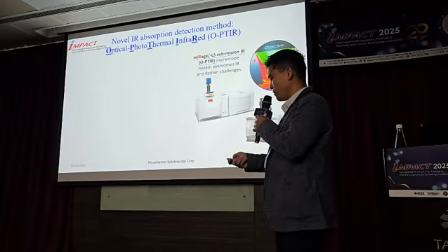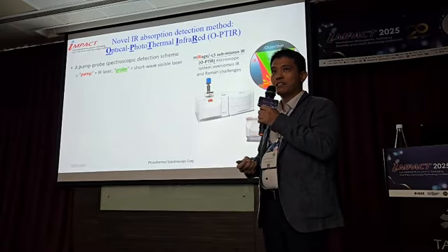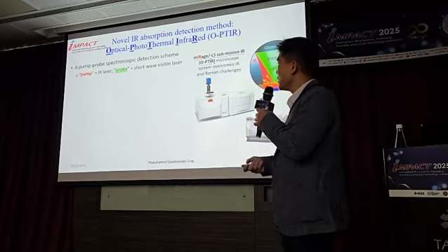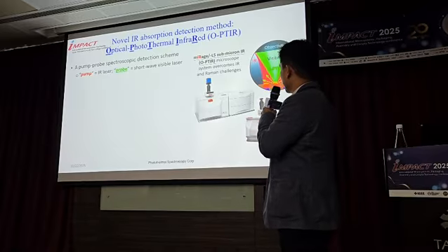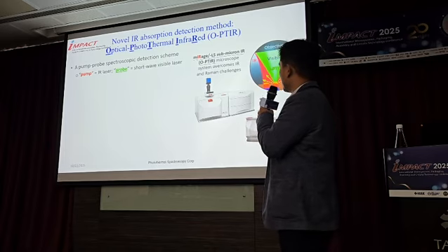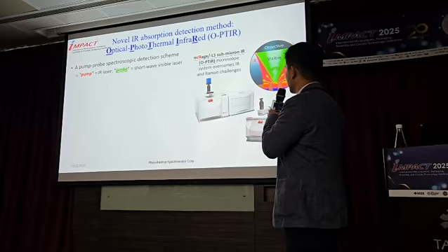This is how it works, in the name of Optical Photothermal Infrared. Instead of just illuminating with IR light, we are introducing a secondary beam. It's the visible probe light. And this IR here is pulse-tunable, and we illuminate it to the surface, as shown here in the schematic. We then detect the photothermal response: as the material absorbs the IR, it heats up, and that changes the refractive index on the surface. And this visible probe detects this change right here on the surface.